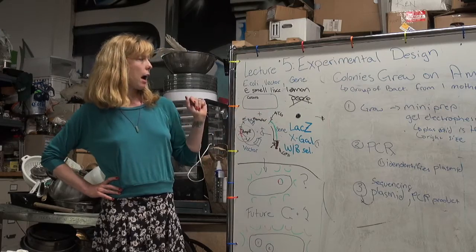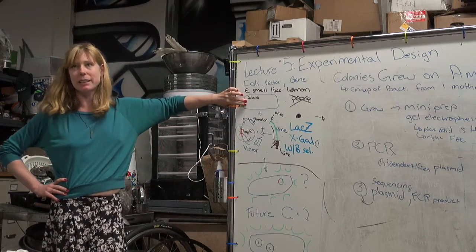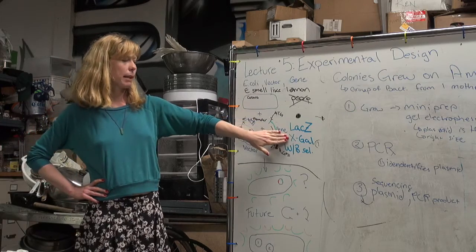or X-gal is just a special thing that we've found as an indicator that works on the plate. Now, the competent cells that you should be using this in should not have lacZ. It should not have that gene to innately make blue.